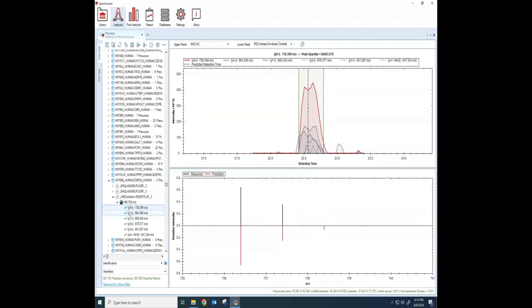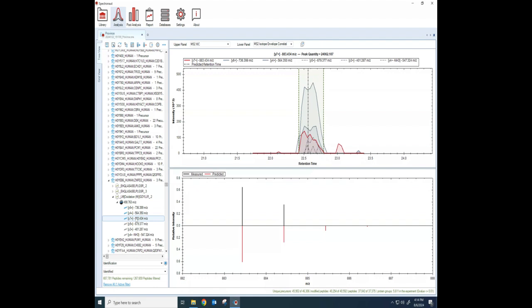And then down below, it's telling me, well, here's the mass that we expected it to be. The mass predicted and the mass that we actually measured. And again, because we have the mono isotopic mass, and then we've got the mass when you have one carbon 13, and then another carbon 13 in there.